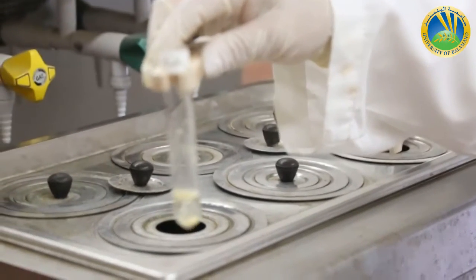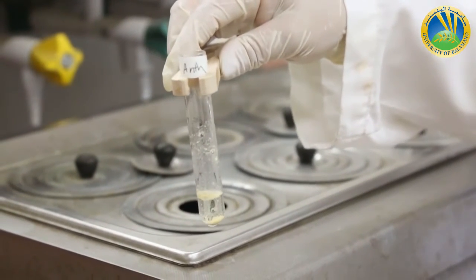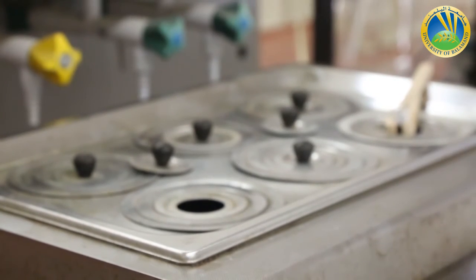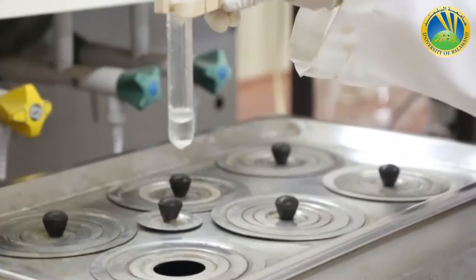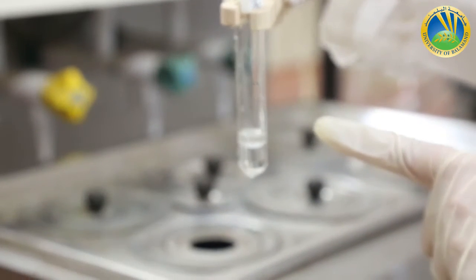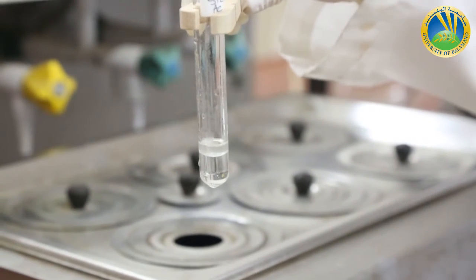Anthracene is not soluble in water even at hot. Stearic acid inside boiling water has formed a second layer at the top of the water.